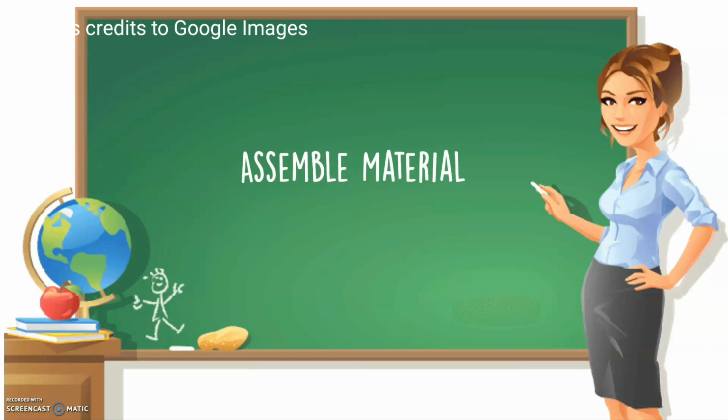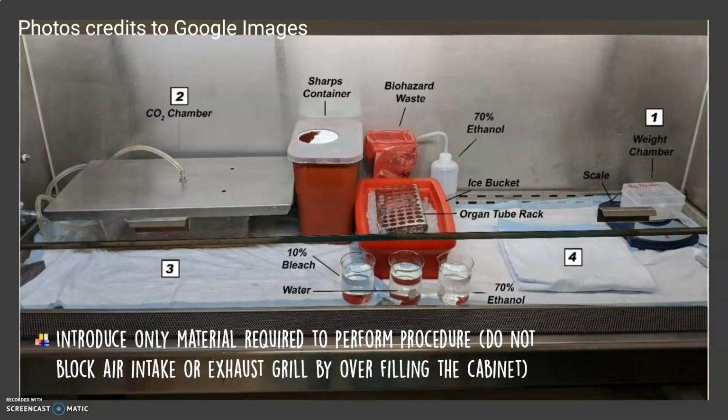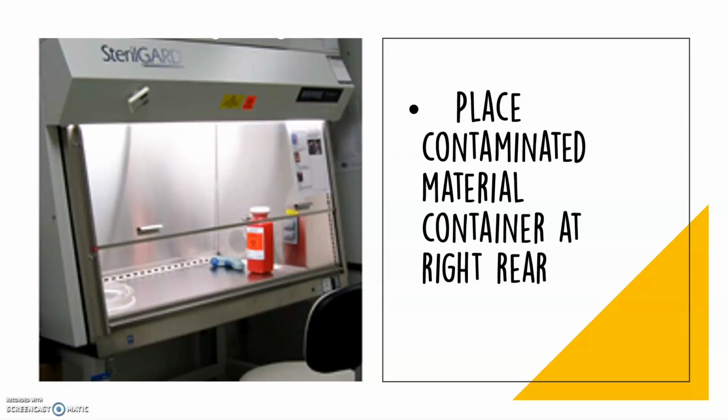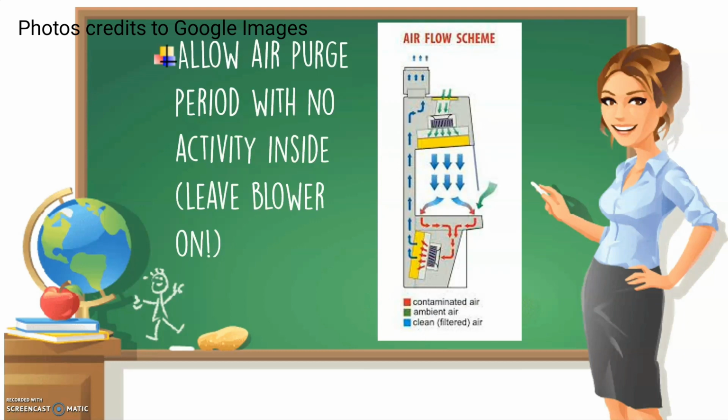How do we assemble material using these biosafety cabinets? First, pre-plan and have all supplies ready for the entire procedure. Introduce only material required to perform the procedure, and do not block the air intake or exhaust grill by overfilling the cabinet. Place material such that clean and contaminated items do not meet. Place the contaminated material container at the right rear. Before you use this, allow an air purge period with no activity inside. So you have to leave the blower on.